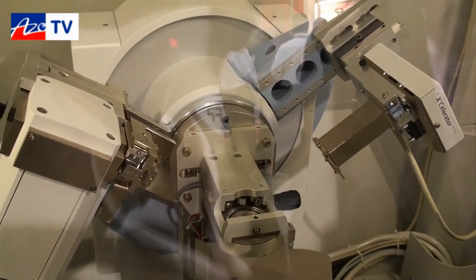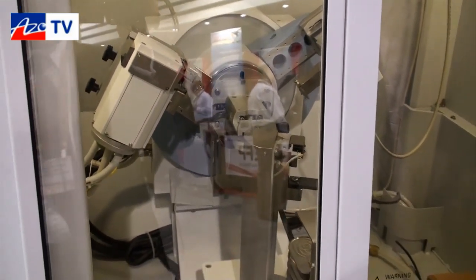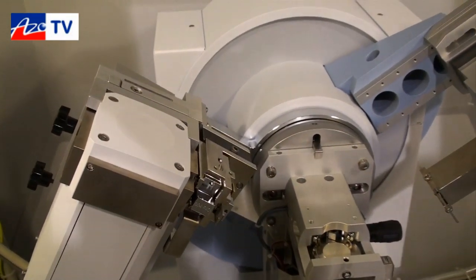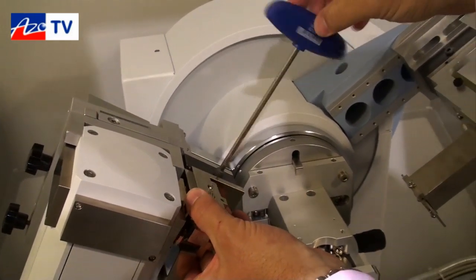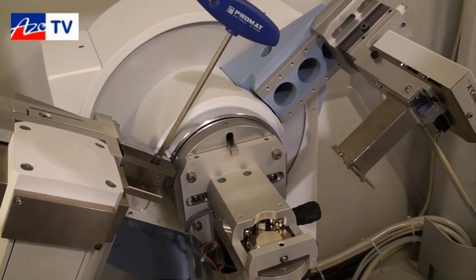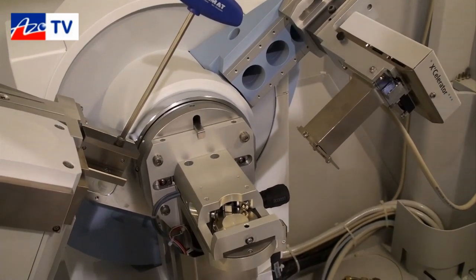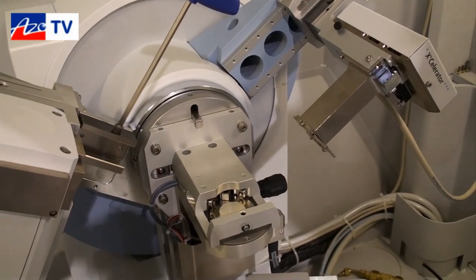The overall system design features a mounting technology that we refer to as PreFIX. They're hardened kinematic tool steel mounts that allow users with a single screw to dismount optical modules, replacing them with different optics like mirrors — parabolic or elliptical — mono caps for micro diffraction applications, texture optics, and more, by remounting them accurately within three microns with a single turn of a screw. The same holds true for stages as well as the secondary beam path with the detectors.